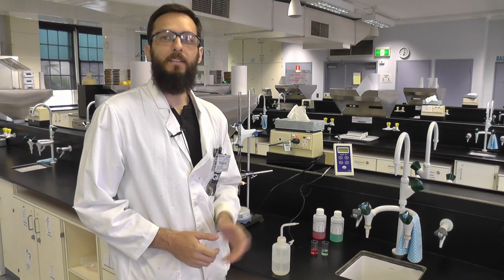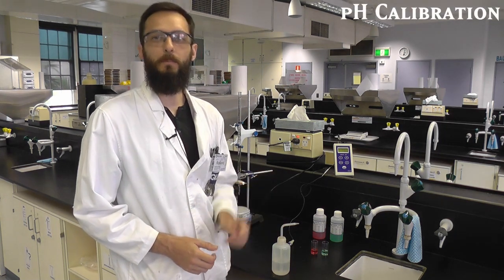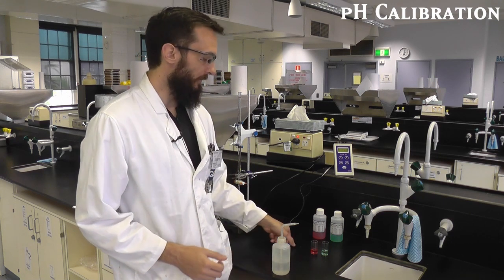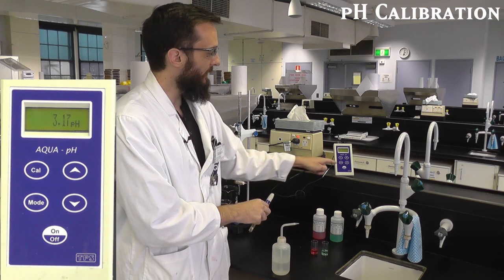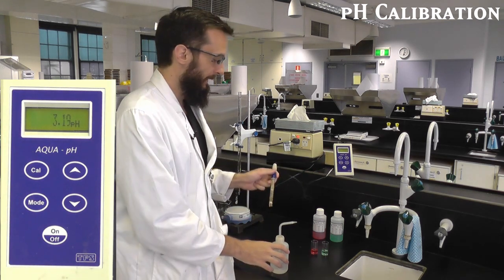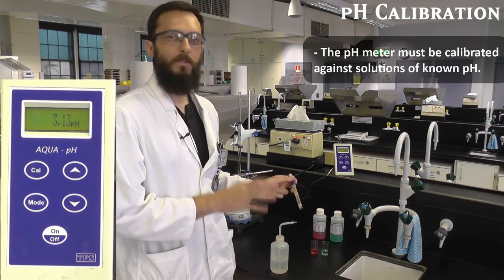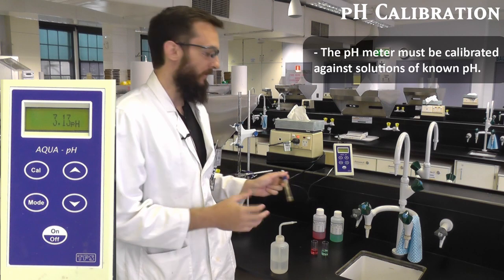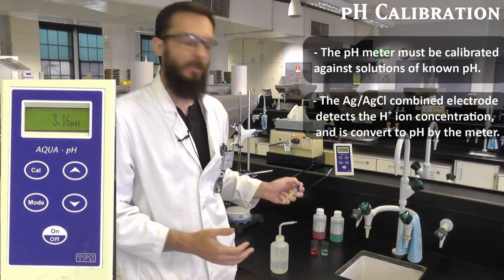Before we can begin our potentiometric titrations, we first have to calibrate our pH probe. It's how we're going to measure pH throughout the reaction. So you'll take one of these probes and attach it to one of these pH meters. If it's not set to the pH mode, just hit the mode button a few times until you find the right setting. Now we need to tell the meter what value a certain pH is. So we can use 2 buffer solutions with a known pH to set up a calibration curve first.